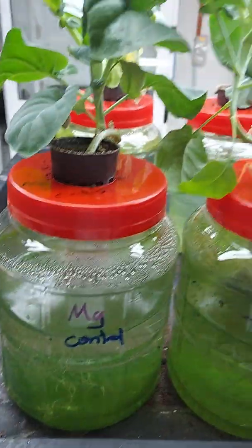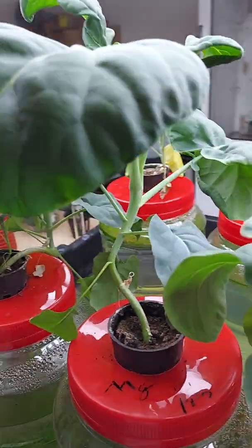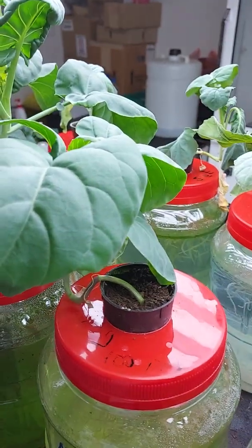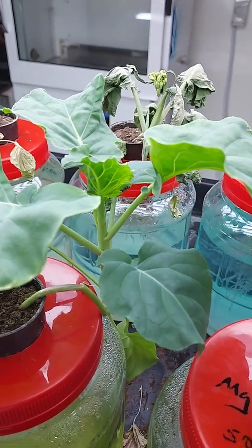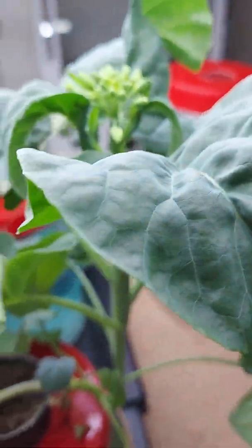So magnesium appeared to boost the growth. So at 10 ppm, you can see the leaf margins have expanded. Again, at 100 ppm, no detrimental effect, and the leaves appear to be growing very well. At 200 ppm, again, the leaves appear to be fully expanded and well grown. And at 500 ppm, there was signs of bolting and flowering.